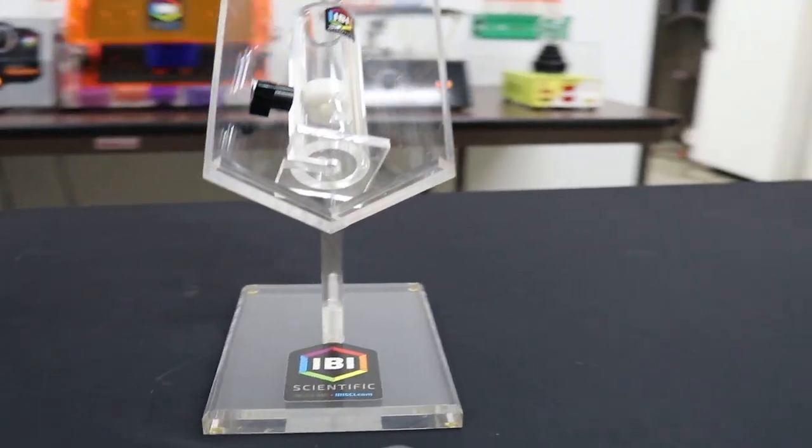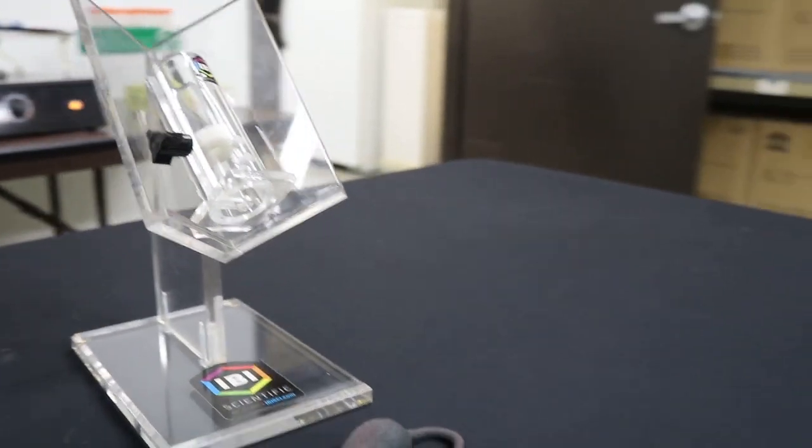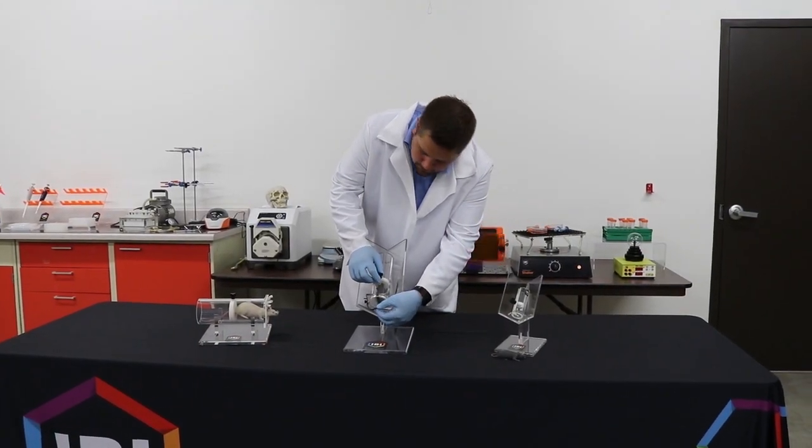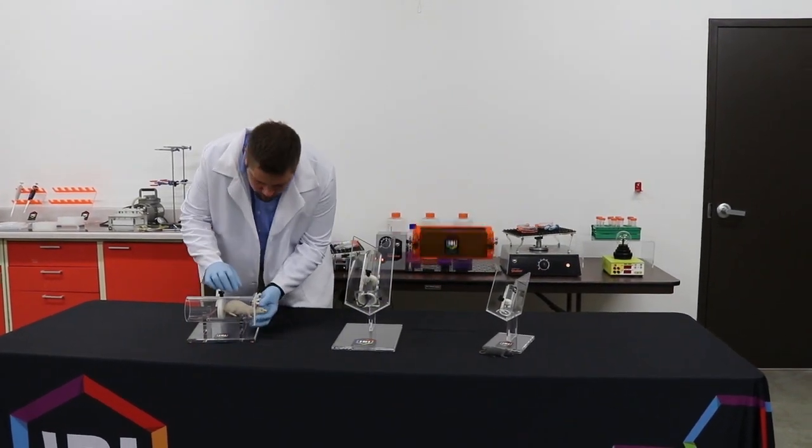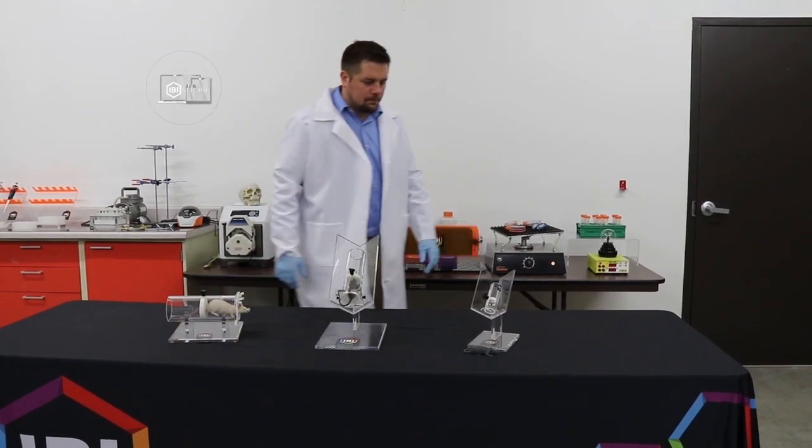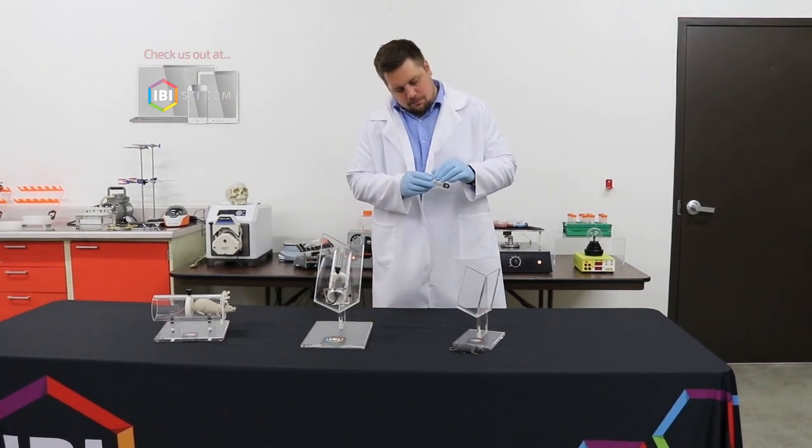The MH-100 mouse restraint is designed to keep both the animal and handler safe in today's life science research lab. The unit comes complete with an adjustable nose restraint and tightening knob to accommodate varying animal sizes.